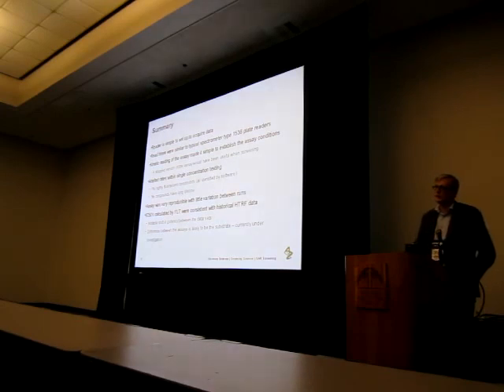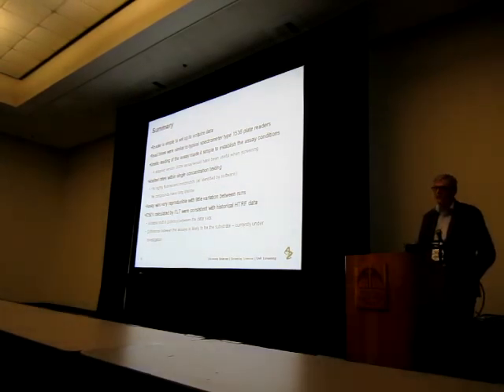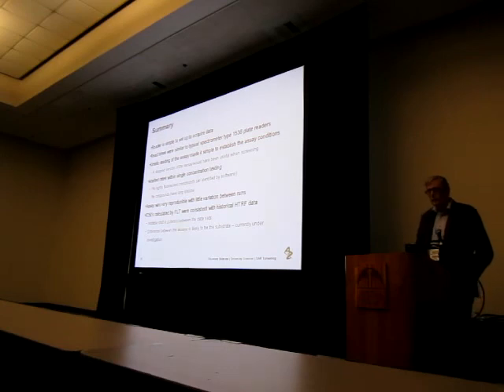whether we're in a serine threonine kinase assay either. And as you can see from the previous slide, the IC50s that were calculated in the FLT assay were comparable to the IC50s that you would get from the HTRF assay, although obviously there was that potency shift. But if what you're looking for is a way of ranking your compounds, then we feel that they would probably rank very similarly in either assay format. And clearly from our perspective, in terms of trying to get a better handle on exactly what's happening here, it's going to be really important to understand the differences between the two assays.